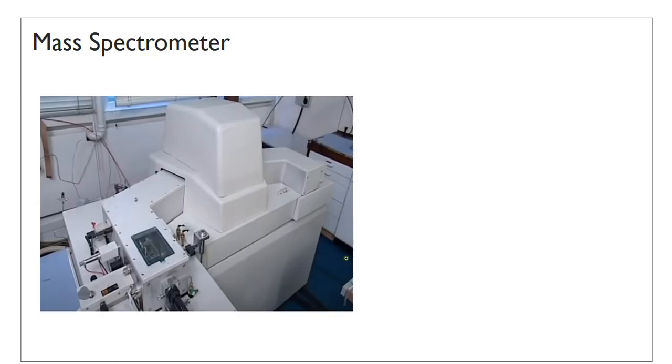Anyway, this is an example of the machine. If you are going to become a scientist in the future, I don't think you necessarily have to know how to operate this machine. You need to be specifically trained to be able to use the machine. Most of the time in major universities or research facilities, you can prepare your sample and then you give it to the technicians who are trained in operating this machine, and then they will return to you with the result. So you just really need to know to read the result, which is a graph. But I'll show you how the technique works anyway.